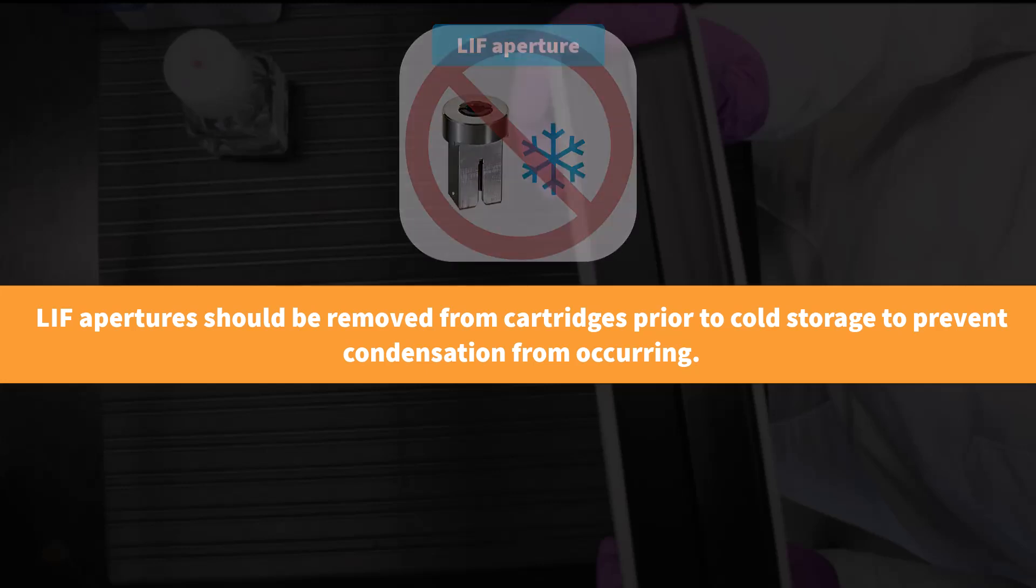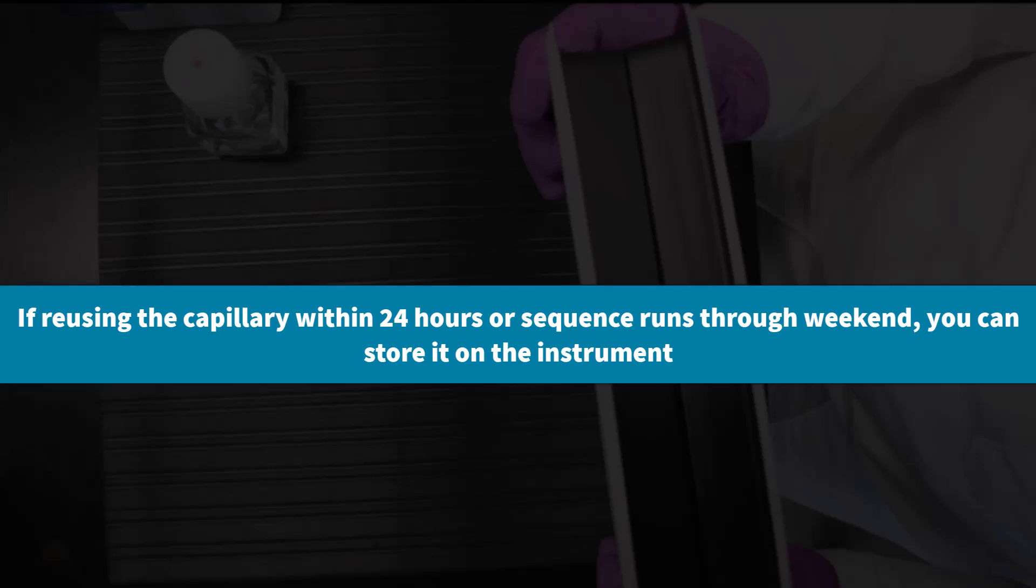In cases where the capillary will be reused within 24 hours, or the sequence will continue over the weekend, you have the option to store your capillary while installed on the instrument.